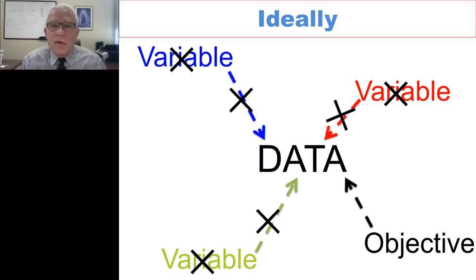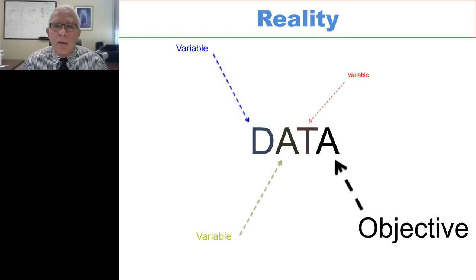So the ideal scenario is to eliminate all variables, so one can focus on the objective. Is this realistic? Probably not. But more realistic is that we can minimize these variables by manipulating the environment and the diets, and by working with the animals, the veterinarians, the IACUC, and the Oversight Committee, by having the right scenarios, environment, and practices, then the objective can be obtained with minimal variables.